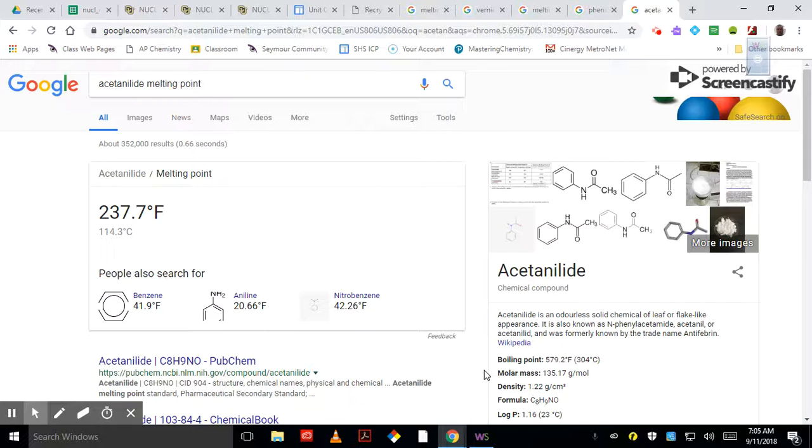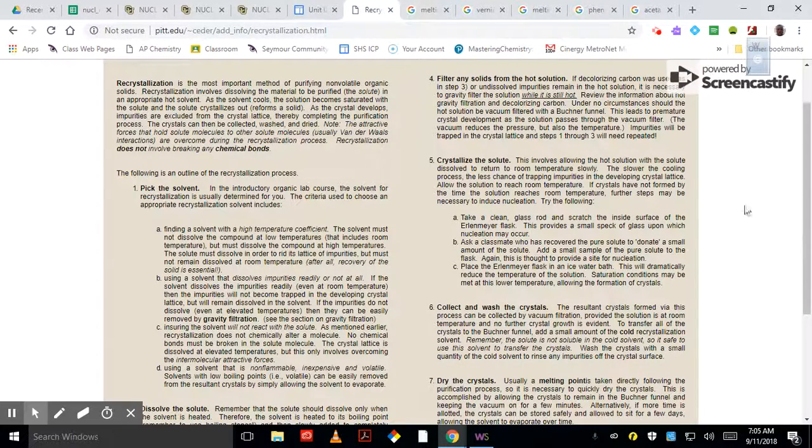In other words, we're going to try to clean it up, get any remaining aspirin or sugar that might have remained with this material and any other impurities that would be in there with it. Get those away from it, and then we will do a technique called recrystallization. And then we'll make a decision upon which of the two unknowns it is by using a melting point apparatus.